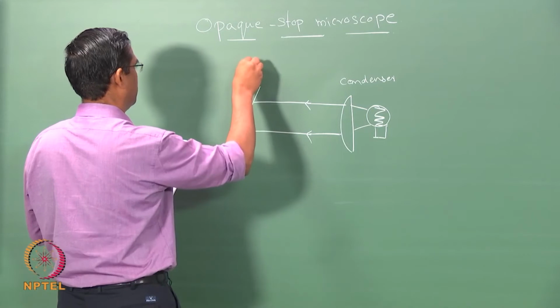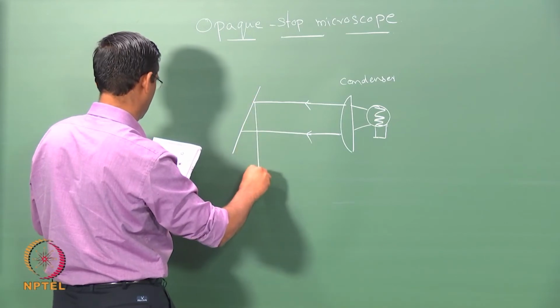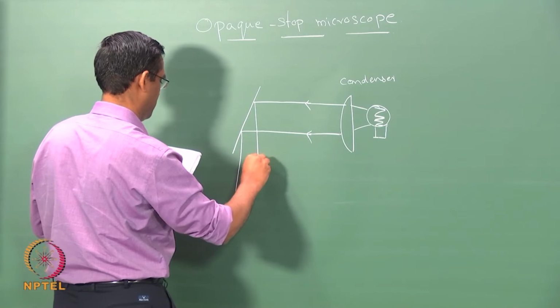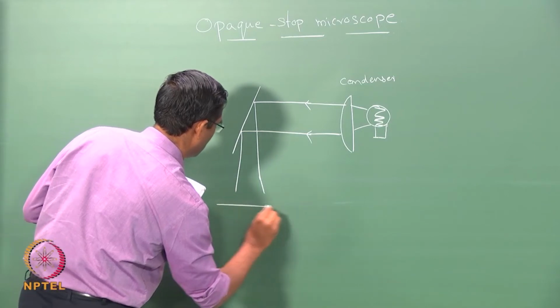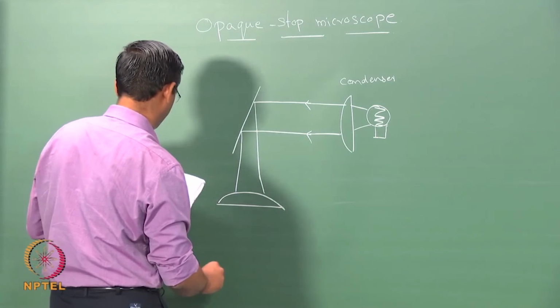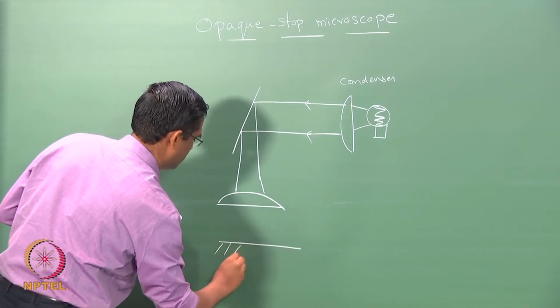Then you have the objective, and then you have the object.